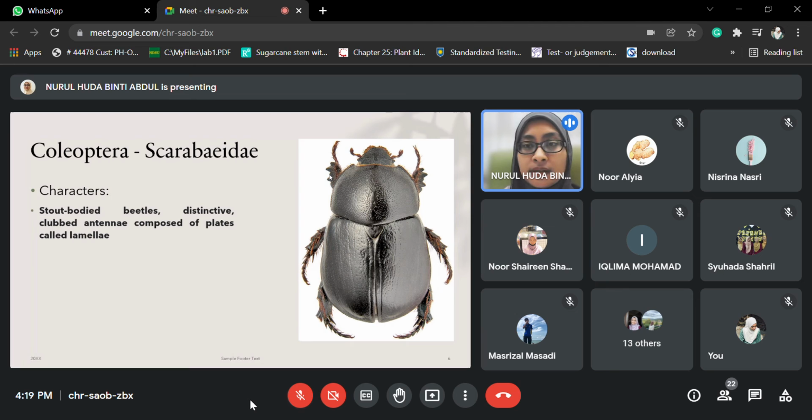Okay, fossorial legs and almost other legs as well. Kalau kamu nampak kat sini kan, compared to dia punya tarsus, his tibia is very large and then dia ada spur as well. So all these thing, karakteristik ni dia membantu dalam dia punya proses kira movement atau dia punya menggali tu lah.